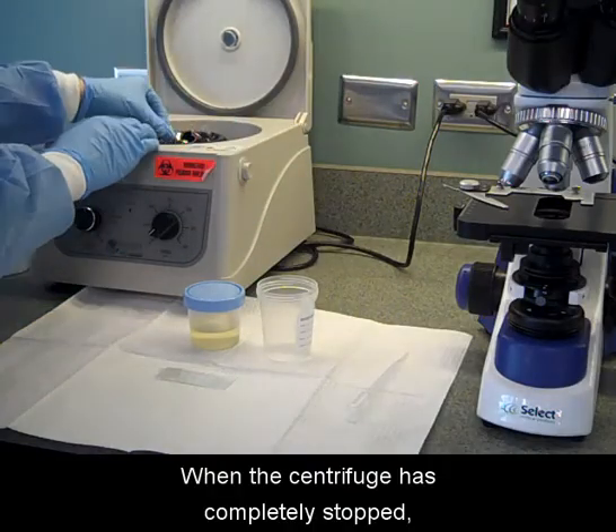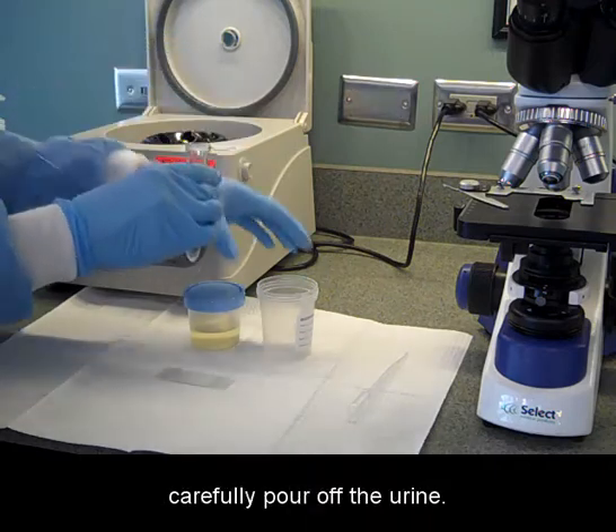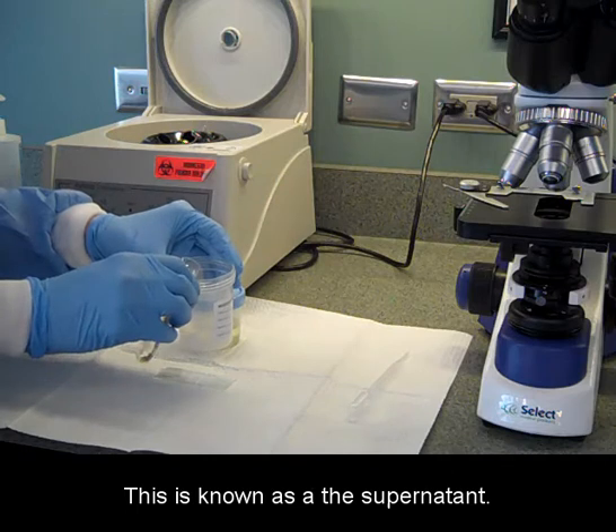When the centrifuge has completely stopped, lift out the tube containing the urine specimen and carefully pour off the urine. This is known as the supernatant.